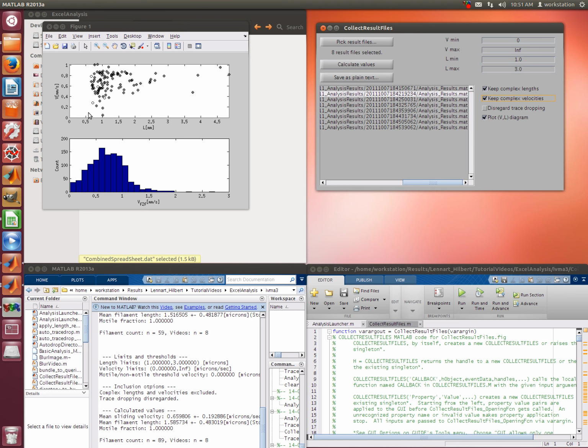If you want to know more about the details and the extent of how this affects the data and analysis and how much the lengths are shifted, as said, the best place to look for the assessment of this is probably the paper where we describe the analysis method, and there in the supplementary you will find more on this.